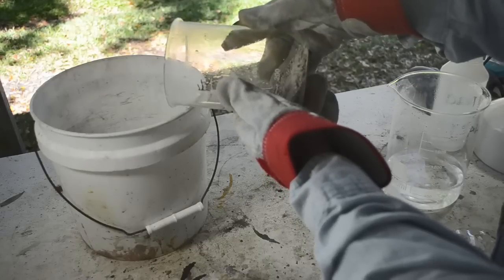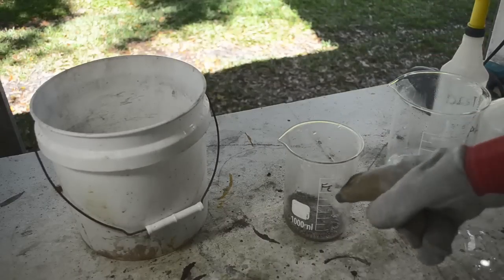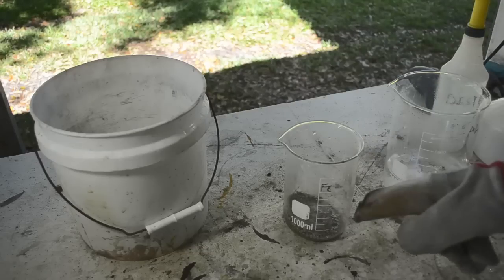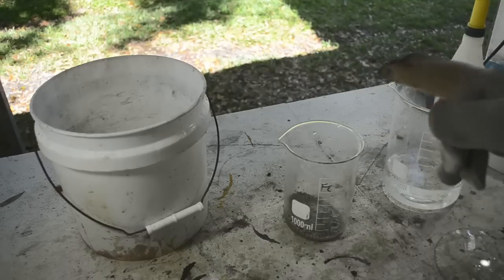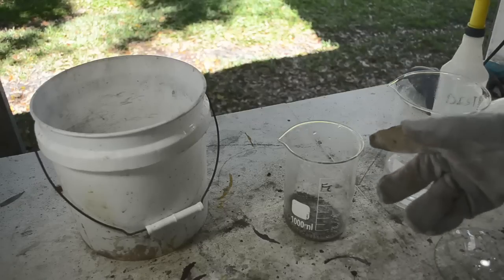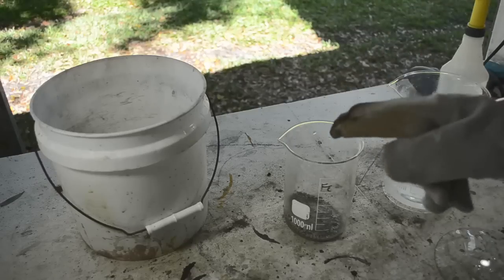Now, if we were going to do a proper experiment here, we would need a control. So I was talking about dividing this stuff up into two batches and doing one with hydrochloric acid and one with sulfuric acid, like my viewers say I should. We should have a control where nothing gets done to it and it just gets melted down. But I've already done that. I already have a lot of experience melting down cement silver, so I know what that looks like. You'll just have to take my word for it.